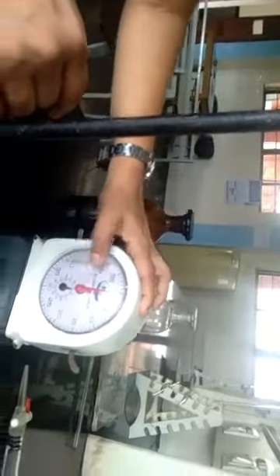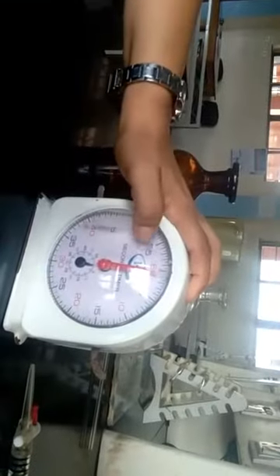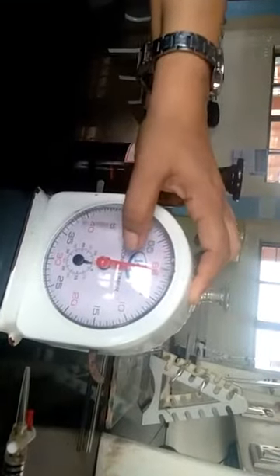Now the liquid crosses this point, and I have started the stop clock. Now I am looking at the time when the liquid level crosses the other point. Now the liquid has crossed this point and I have stopped the stop clock. If you see, it is 1 minute 1 second, that is 61 seconds.